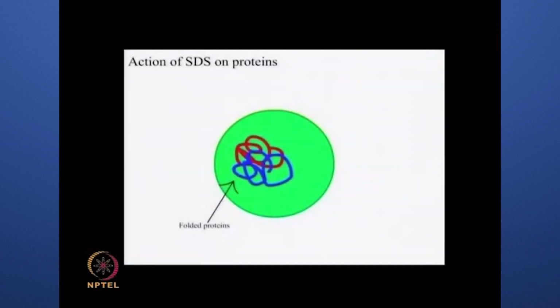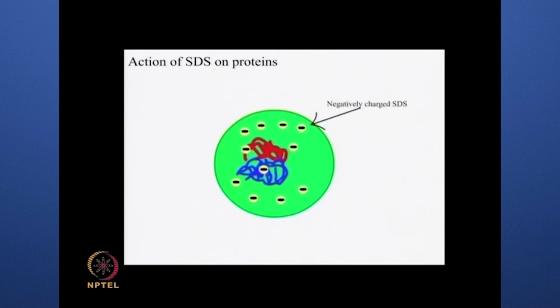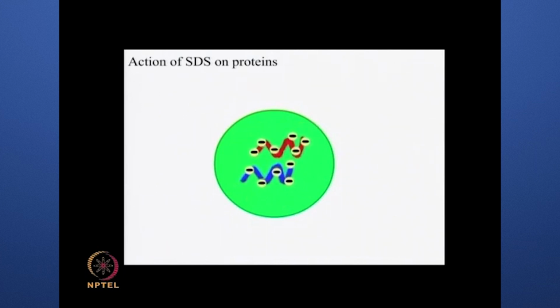All the proteins present on the IPG strip carry a large negative charge due to the action of SDS, which denatures the protein and binds to the polypeptide backbone at a constant weight ratio. This ensures that the proteins present get separated exclusively on the basis of their molecular weights rather than their mass to charge ratios as in a native PAGE.